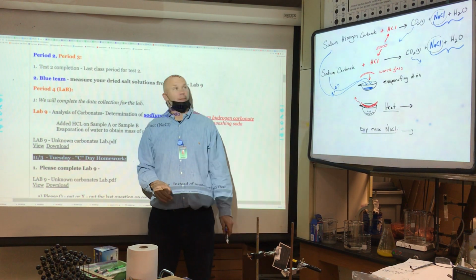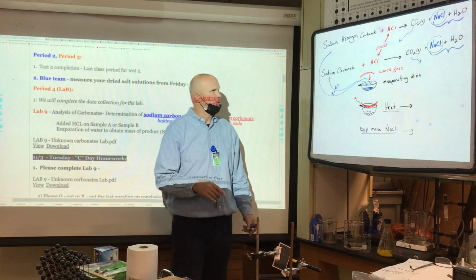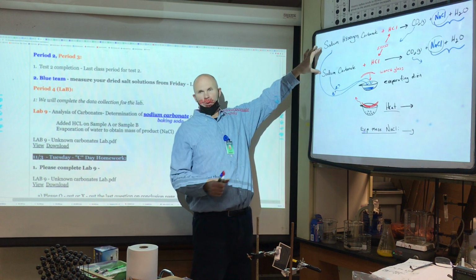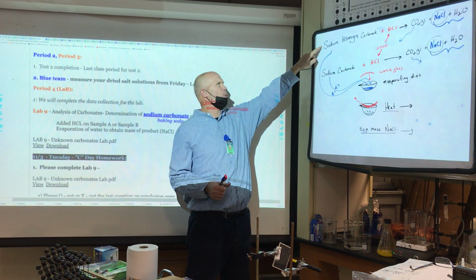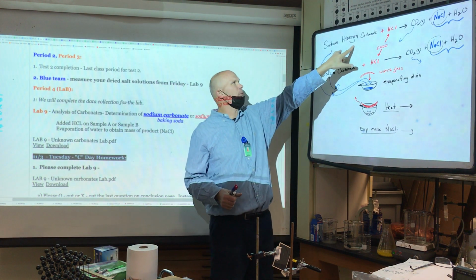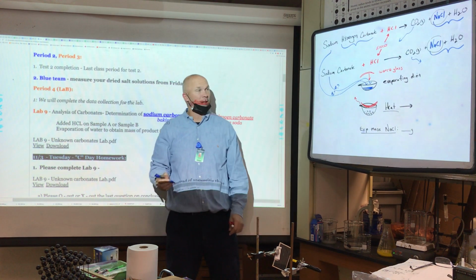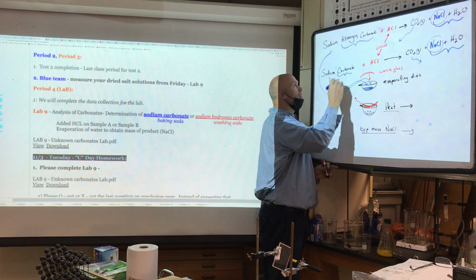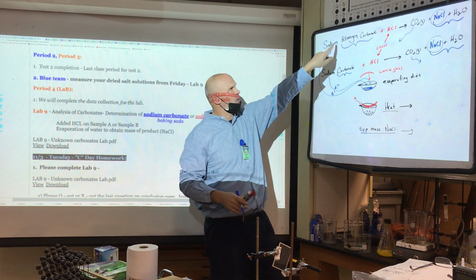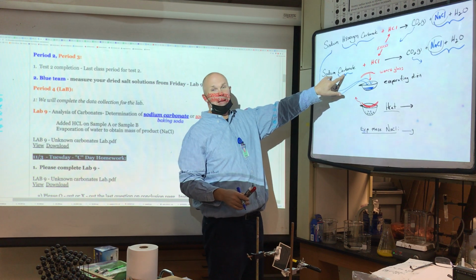So what do we do with that? If you go to your conclusion page, it's the last page, here's what you do. I have given you these two reactions. I don't know which one's first or second, but I think this one might be first. I want you to write the chemical formula. If you don't know what hydrogen carbonate is, you go to table E or F of your Regents chemistry table. Same thing, these are salts. Sodium is the metal in front. This is a negative ion here. Write the chemical formula. Then I want you to balance. You do the same thing for this one. Write the chemical formula and then balance.